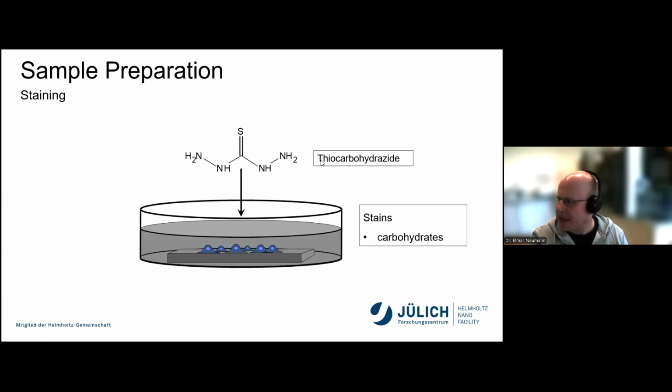Next thing is we stain the sample with thiocarbohydrazide, and literature says it's for staining carbohydrates. I also need to admit that we do not do any research on these protocols, so I cannot tell you anything about the differences, with or without.